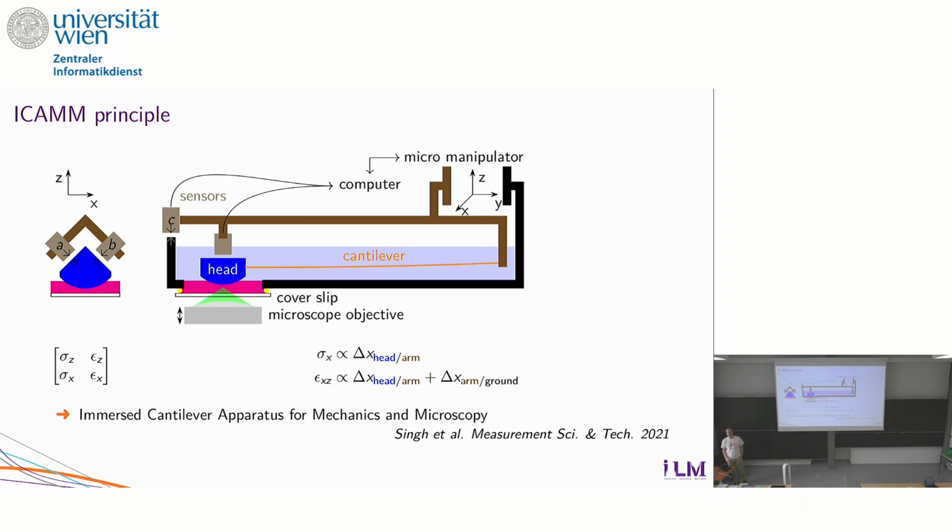So how is the shear stress controlled? Basically by feedback loop. We are neither stress control nor strain control. We're somewhere in between. We need feedback loops on any of the things we want. So we can choose to have stress control in shear and strain control in the normal direction. That's what we do, everything that we'll show you. But we can have all the choices if we want. So just like a rheometer, basically, in that sense.